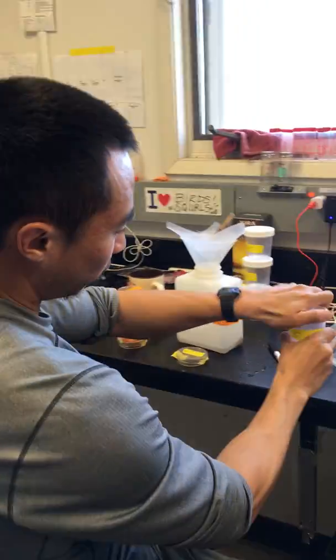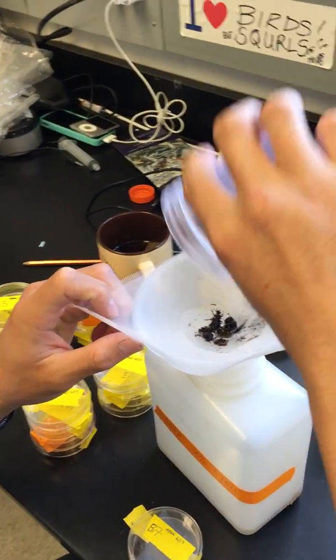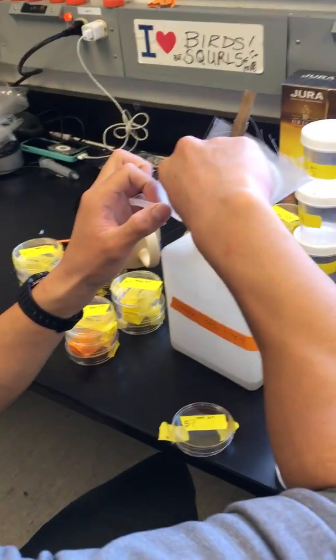So we filter out the alcohol and keep the bugs. And then we just pick out whatever insects we see.